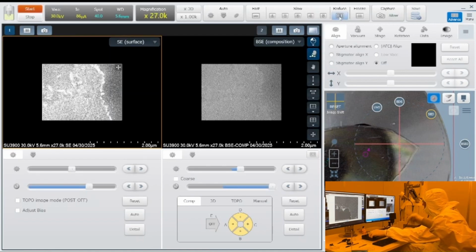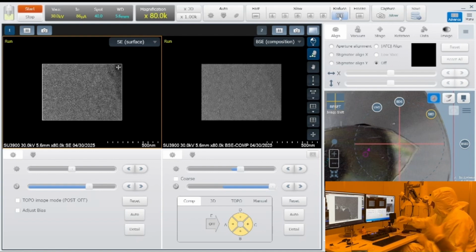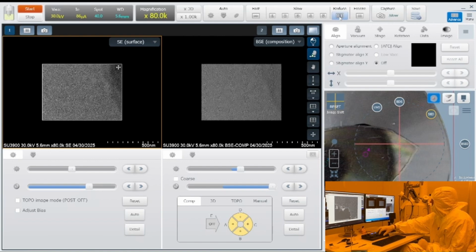The more grain boundaries you have, the more losses you have. So we need to maximize the grain size so you have fewer grain boundaries. So we need to look at the deposition conditions that will give you the highest grain sizes, as well as your surface conditions, because that also influences the grain size.